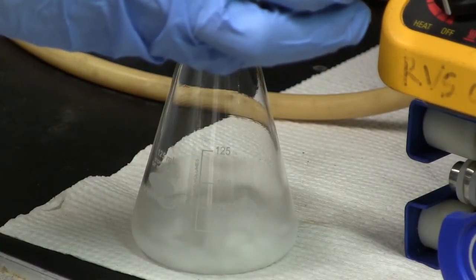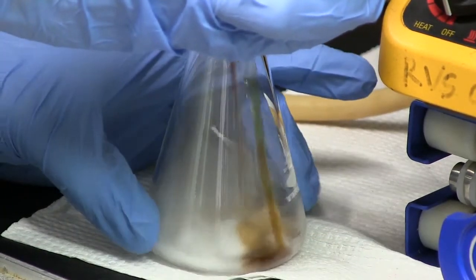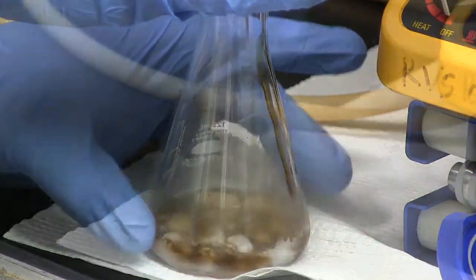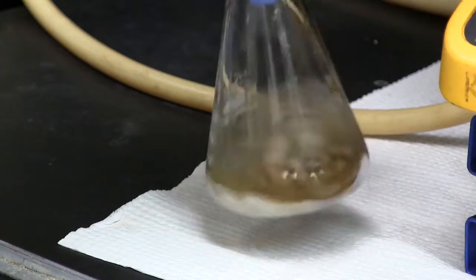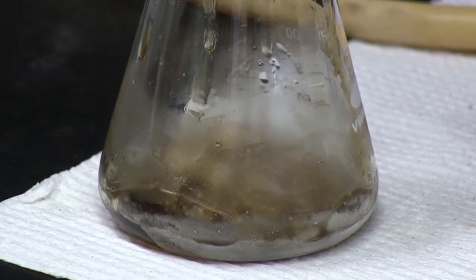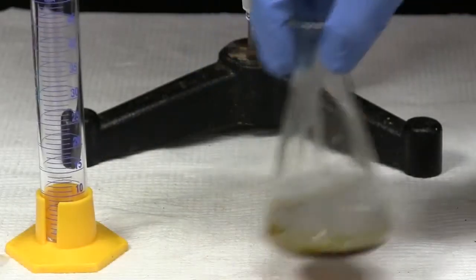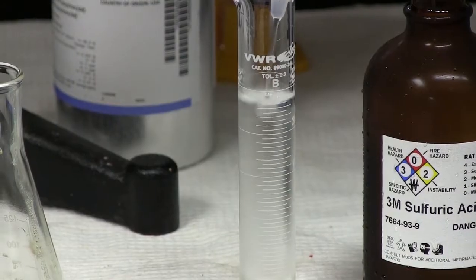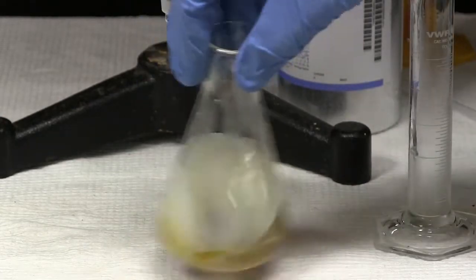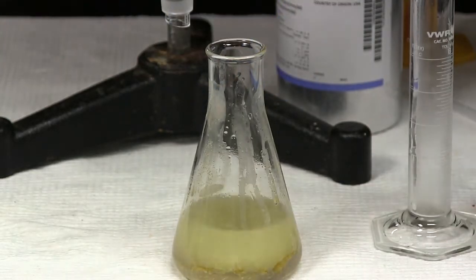In a 125 milliliter flask, add about 20 grams of crushed dry ice. Carefully pour the phenylmagnesium bromide solution over the dry ice. Swirl the contents until the solution becomes so viscous that mixing appears to have stopped. Add 40 milliliters of technical diethyl ether to the flask. Carefully add 25 milliliters of cold 3 molar sulfuric acid. If the ether evaporates appreciably during the process, add more ether to maintain the approximate volume of 40 milliliters.